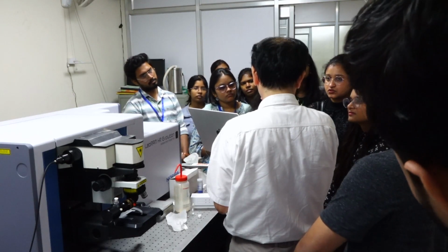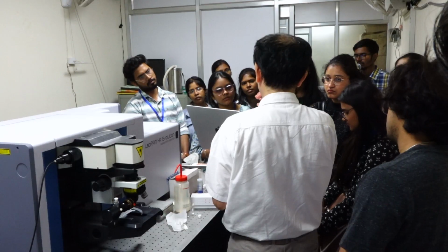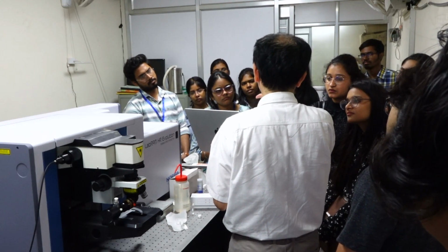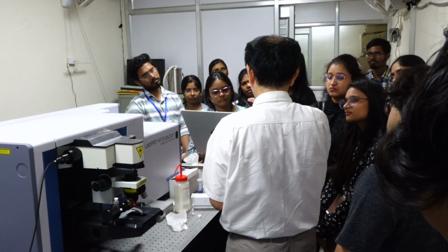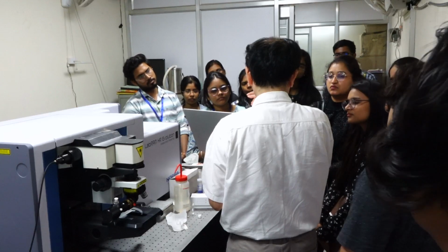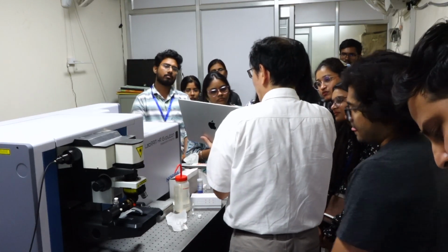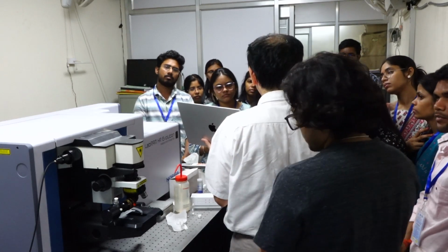If the time is finite, then we should increase the exposure time as long as possible and decrease the accumulation number. It's because one of the origins of the noise is the AD conversion noise.